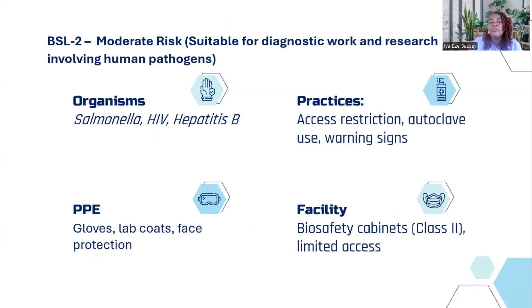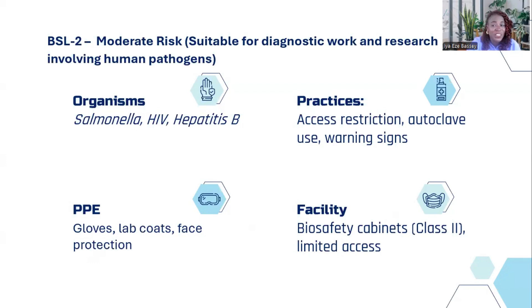For BSL-2, you have moderate risk and it's suitable for diagnostic work and research involving human pathogens — the kind of labs you see in teaching hospitals, general hospitals, and specialist hospitals. Work involves organisms such as Salmonella, HIV, and hepatitis. Safety practices include access restriction — not everybody should have access to the lab — an autoclave for disposing of organisms, warning signs everywhere, and protective equipment like gloves, lab coats, and face protection. You should have at least a class-two biosafety cabinet and limited access.